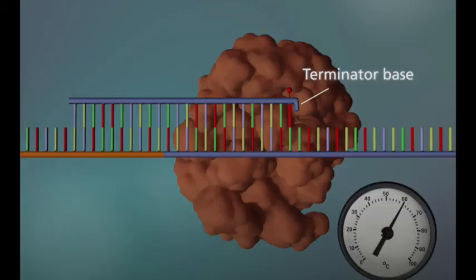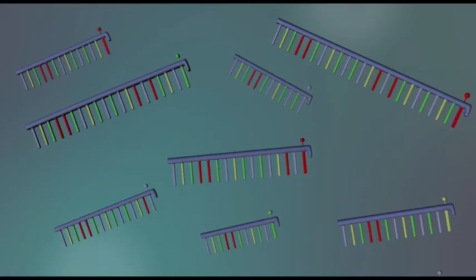The same sequence of denaturing, annealing, and elongation will occur, but whenever a terminator base is added, the strand will end there with a fluorescent molecule. In the end, you get thousands upon thousands of different short segments, each ending in a fluorescent terminator base for the different A's, T's, G's, and C's.